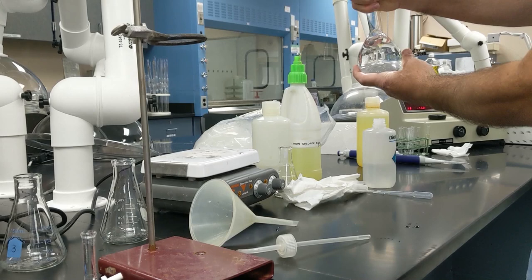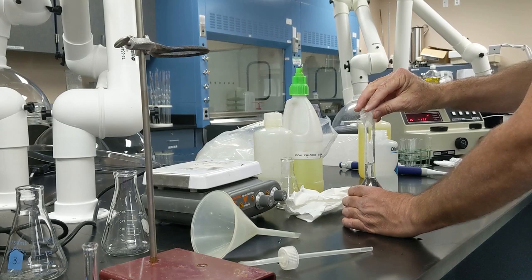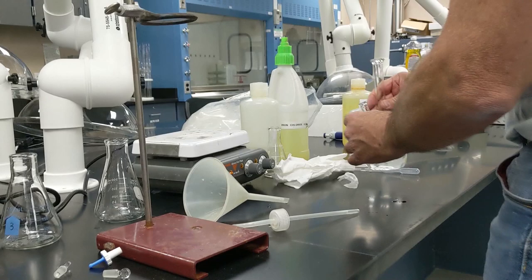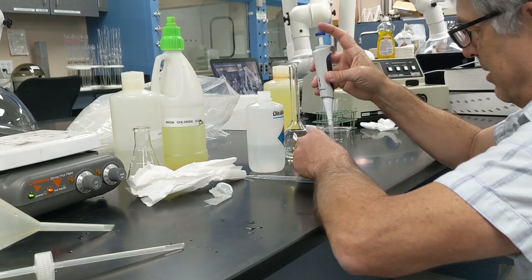So it's always a good practice to mix this several times to make sure it's homogeneous. Okay. And then I'm going to take a portion of this and I'm going to pipette 3 milliliters of this solution into a 25 ml flask. I've got a clean beaker now. And I've got a 1 mL pipette, so I'm going to give it 3 shots from this pipette.